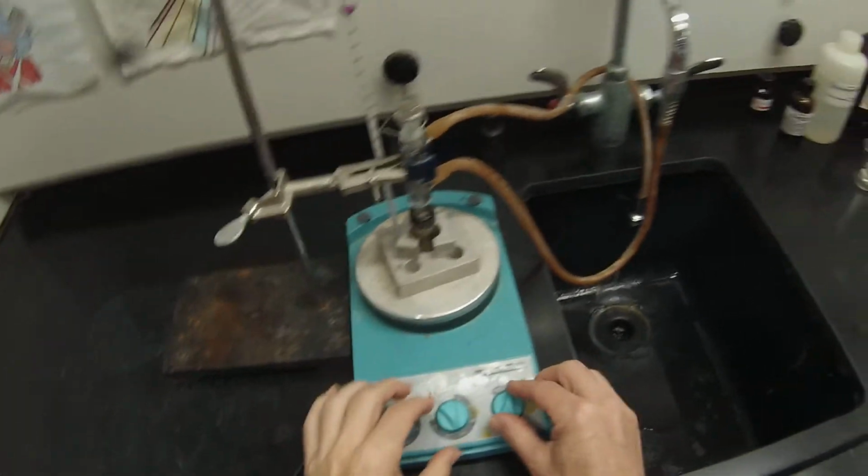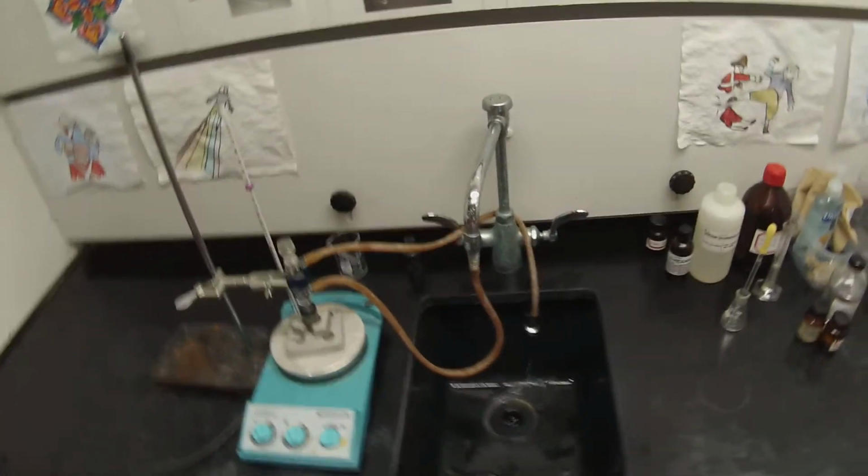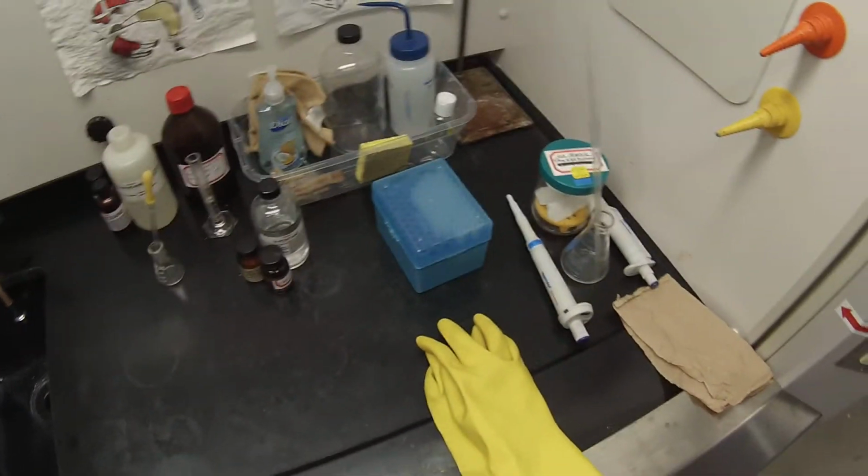So we'll just let that heat. Got a good flow rate. That looks like it'll keep going nicely. And we're up to about 50 so far.